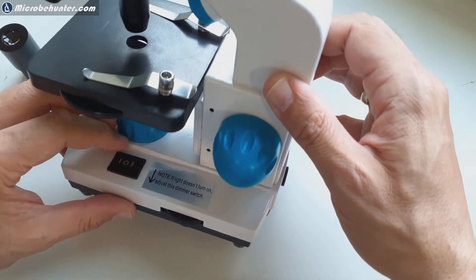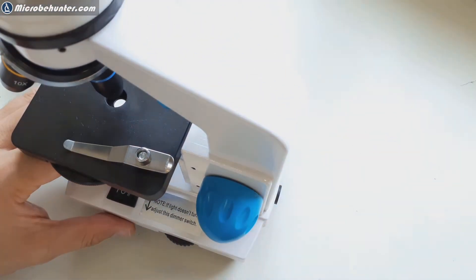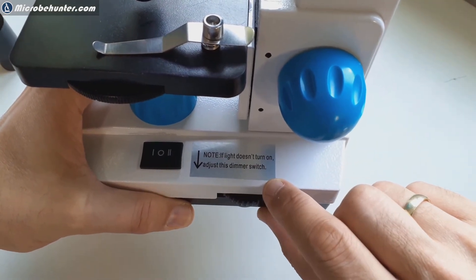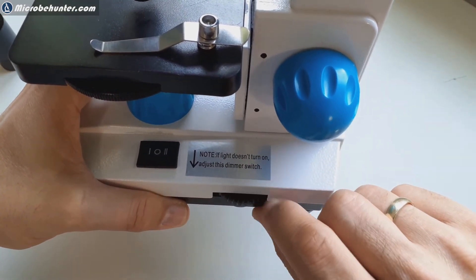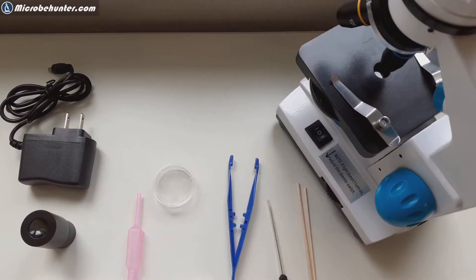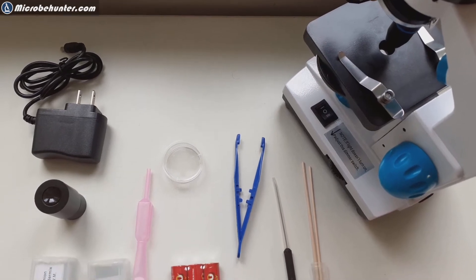And I also found that there was a sticker note, light doesn't turn on adjust. If the light doesn't turn on you have to adjust the dimmer switch so apparently some people switched on the light and forgot to turn up the dimmer and therefore it didn't work.